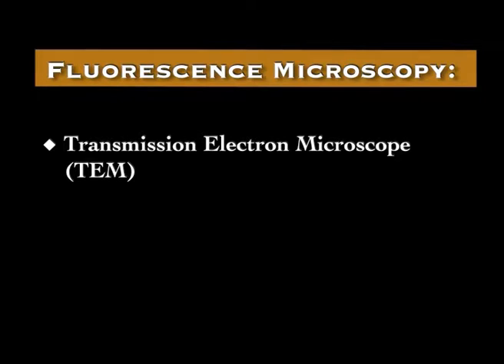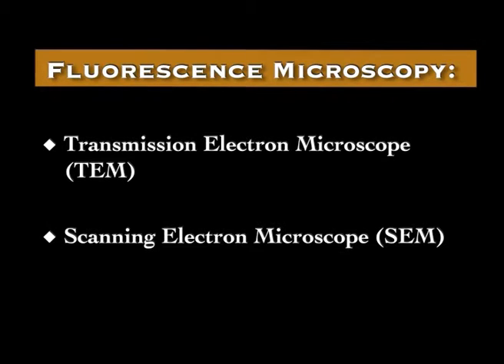Now I will also talk about the use of electrons in illuminating objects and talk about the details of the transmission electron microscope or TEM and the scanning electron microscope or SEM. Coming to fluorescence microscopy and the assays, let's also talk about fluorescence.